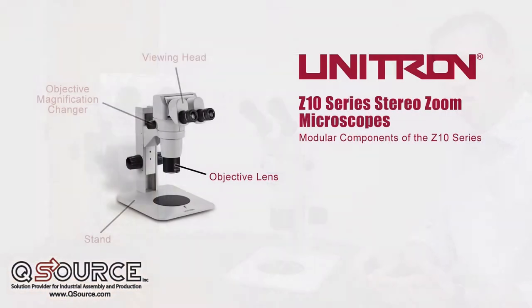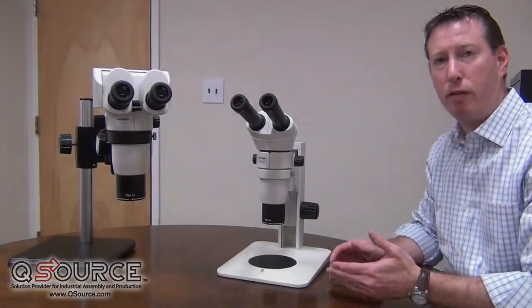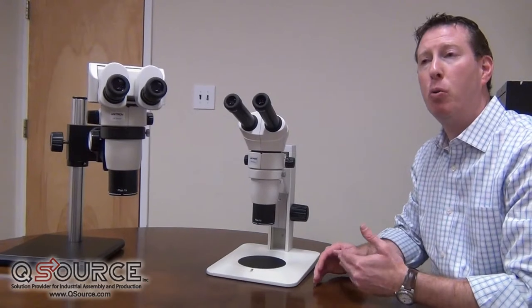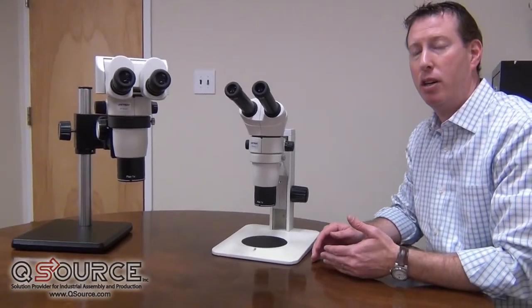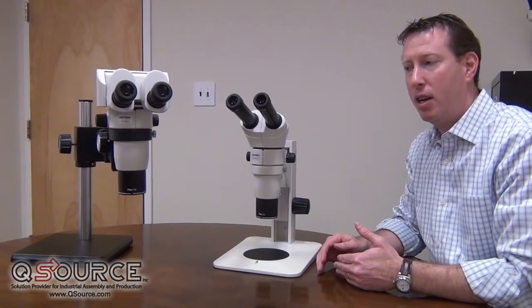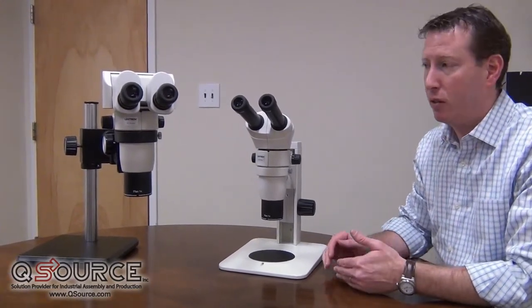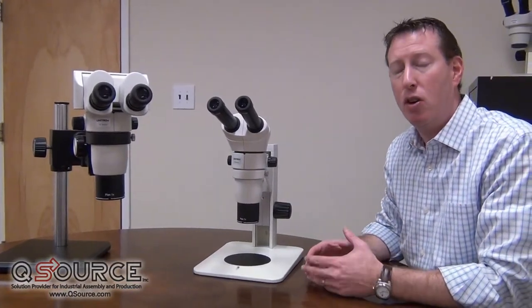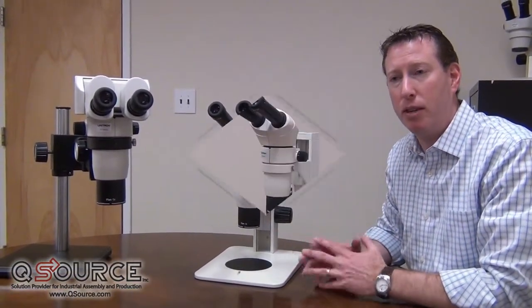The third component in this modular system is the objective itself. Here you have a couple of different choices. The most standard being the 1x plan objective, which yields a working distance of 78 millimeters. However, some specimens may require more working distance — that's where you would use a half-x lens, for example on a ball bearing stand, to give you more working distance to cover a wider or higher specimen size.